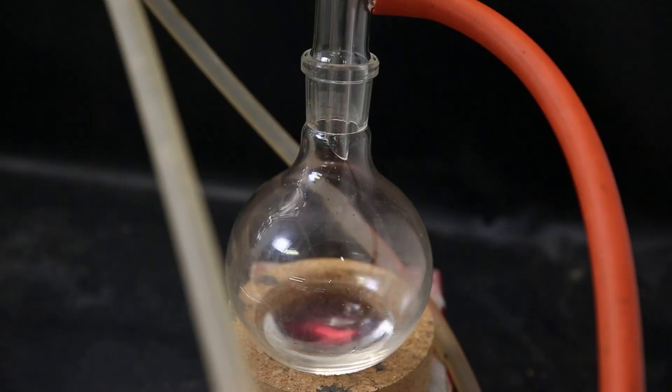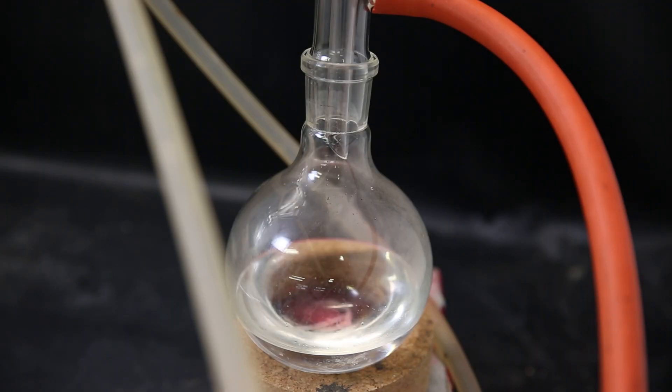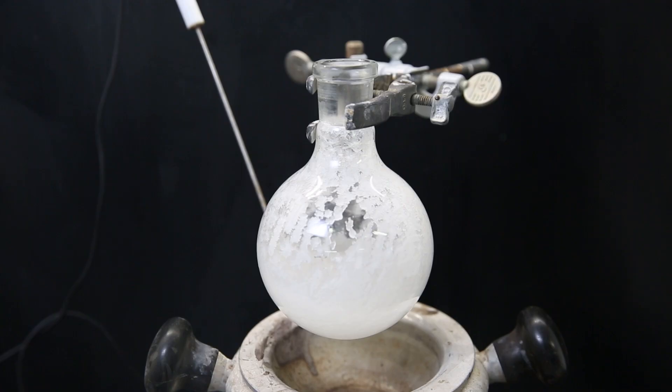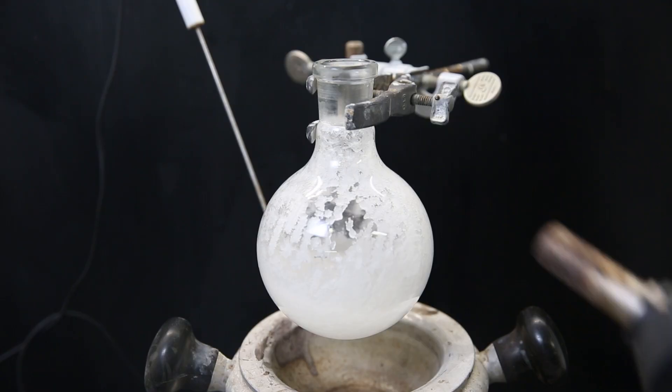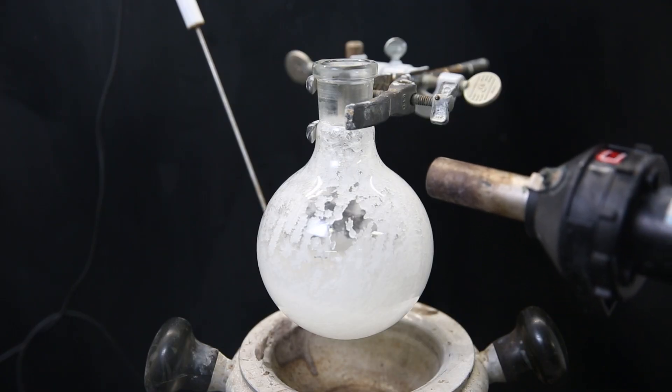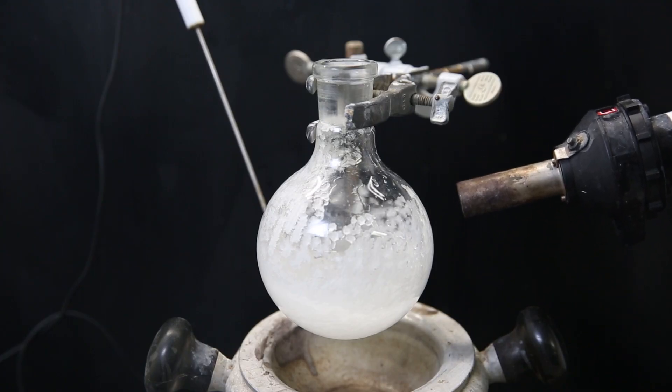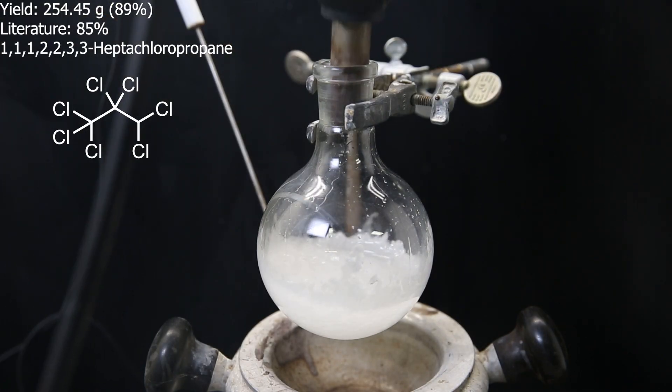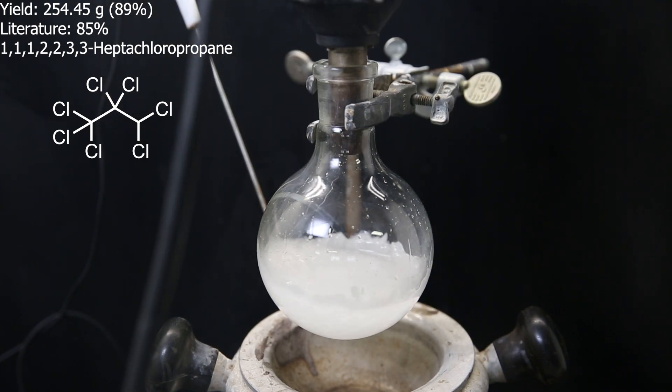After a while the product starts distilling over as a clear liquid. When it is done, all that is left in the flask is some brown crap. When I let the air into the setup, it knocked up some of the liquid and the product immediately crystallized. I melt it back down and I measure the yield to be 254.45 grams or 89%, which is higher than the literature.